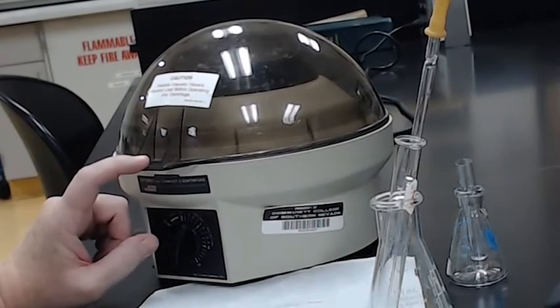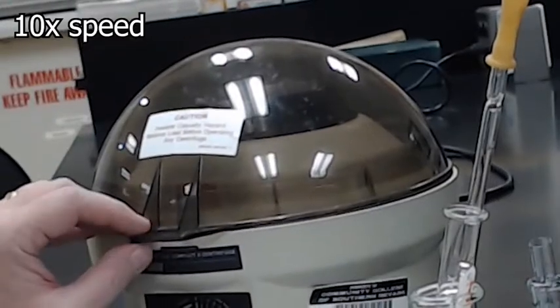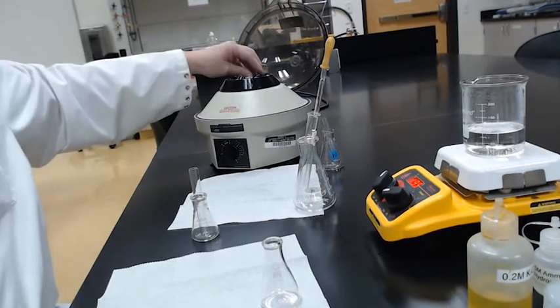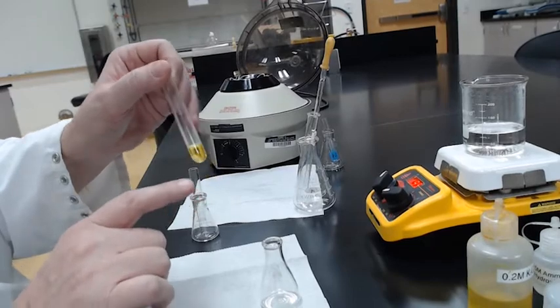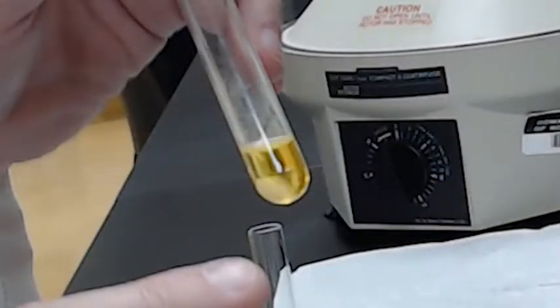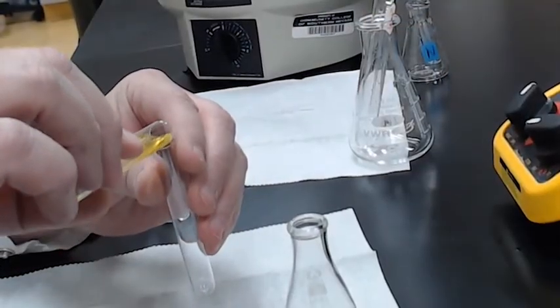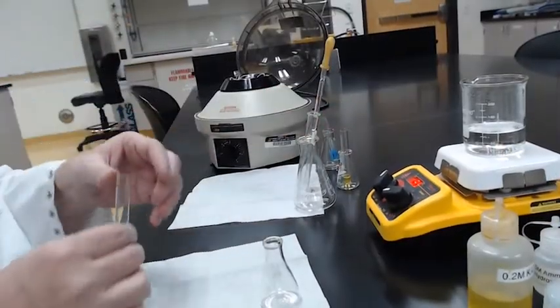Again, we need about 30 seconds at high speed. Okay, so when we centrifuge, we have the clear yellow liquid on top, and we have our precipitate on the bottom. The clear yellow liquid may contain calcium, so we're going to decant that and save the liquid for a calcium test. And that's supernatant number 2, so we'll put that one over there.